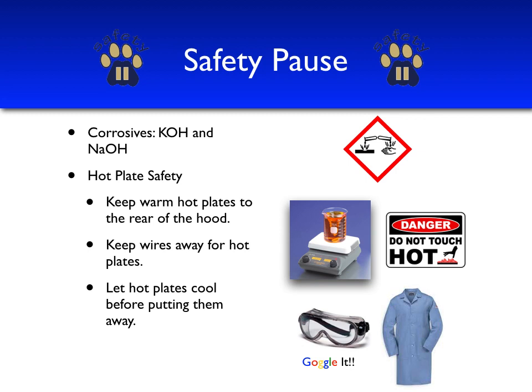And we also want to make sure that we keep all wires, namely the wires from the temperature sensor and the LabQuest Mini, away from the warm hot plate. We also want to let the hot plates cool down before putting them away in the designated cabinets. And as always, we want to make sure that we goggle up and wear our flame-resistant lab coats.